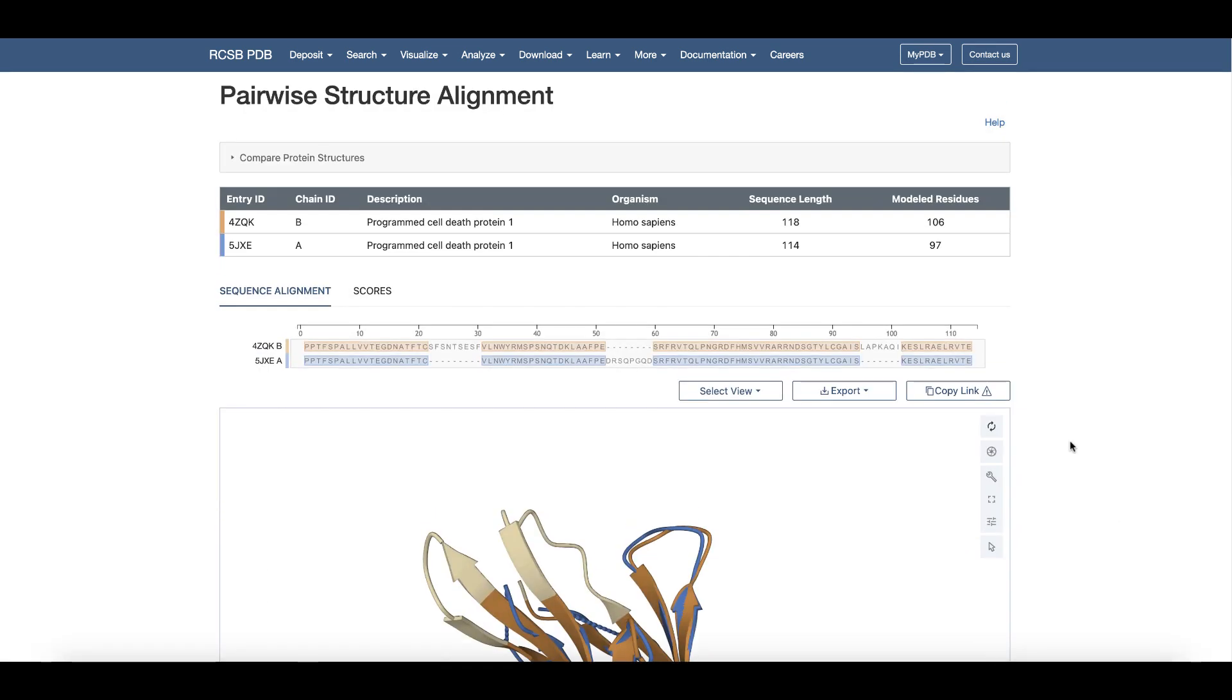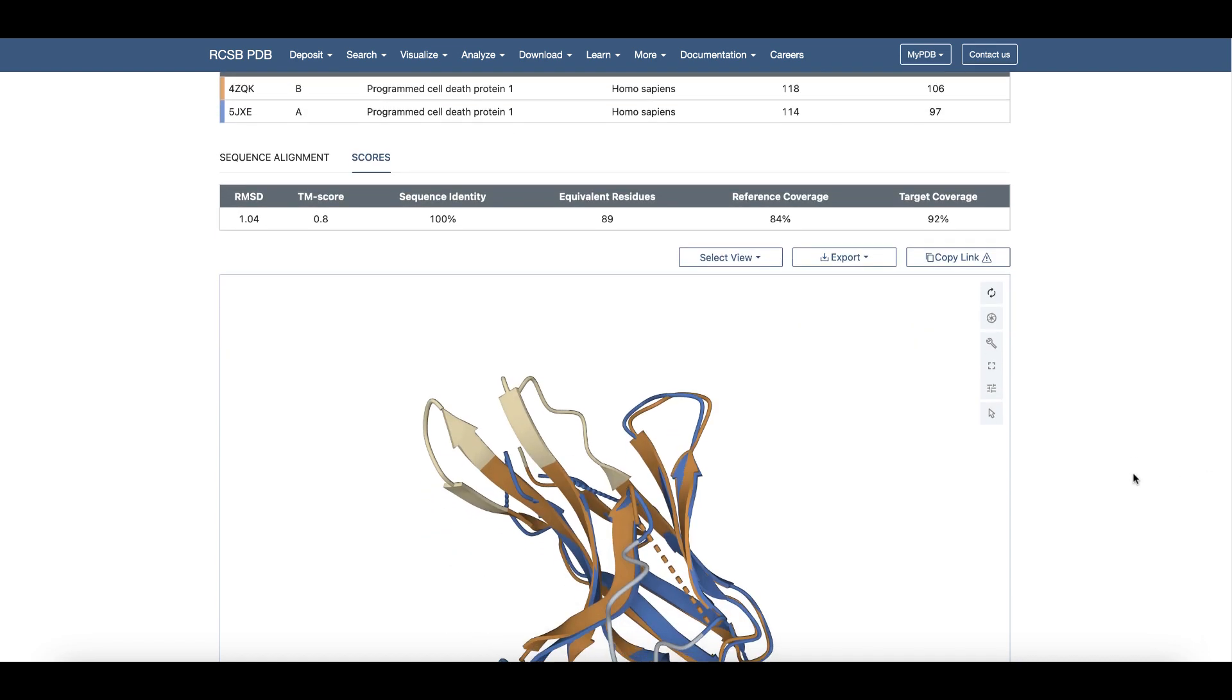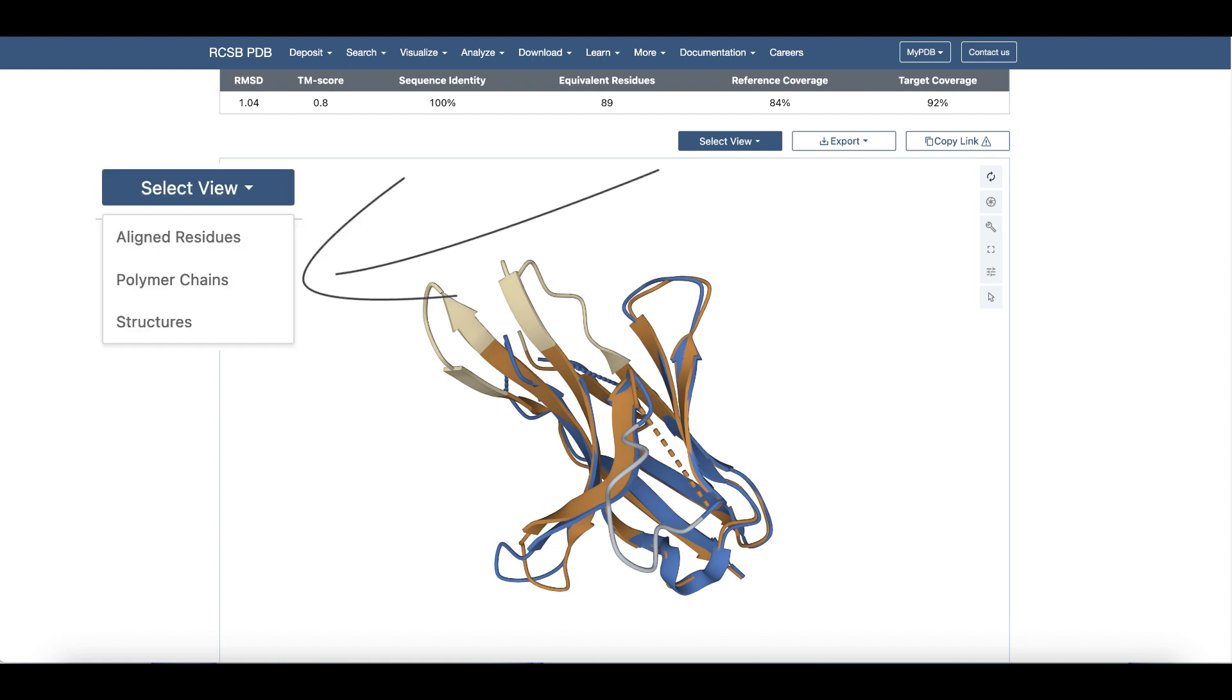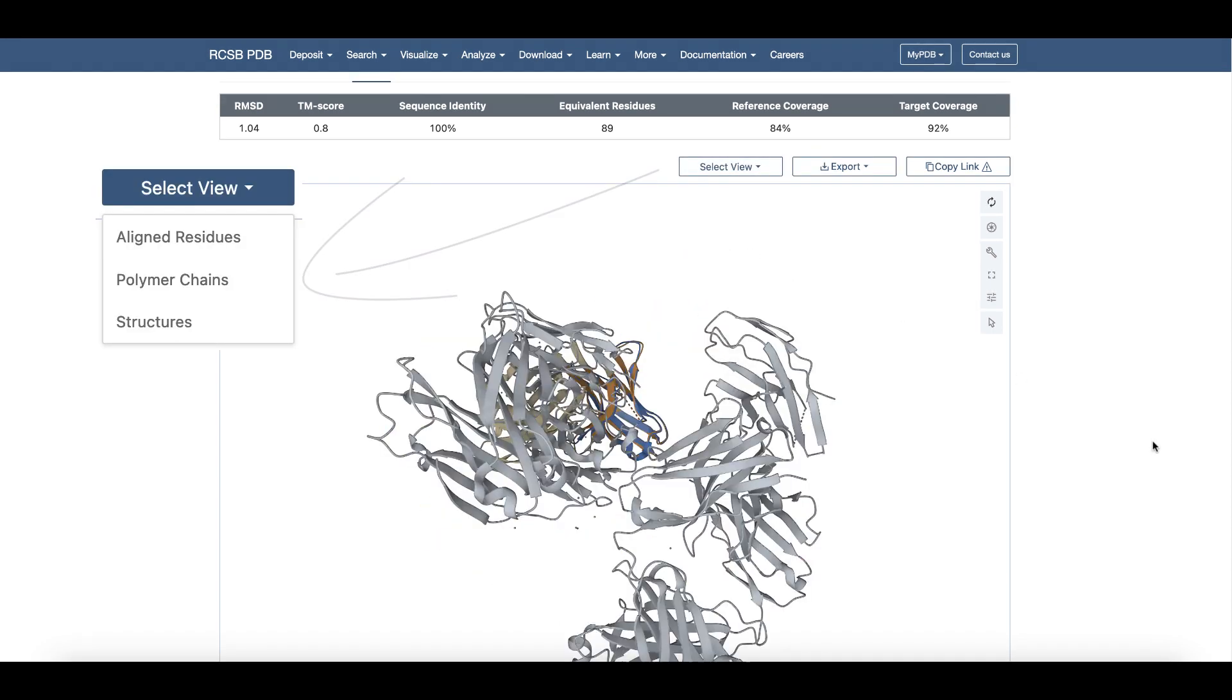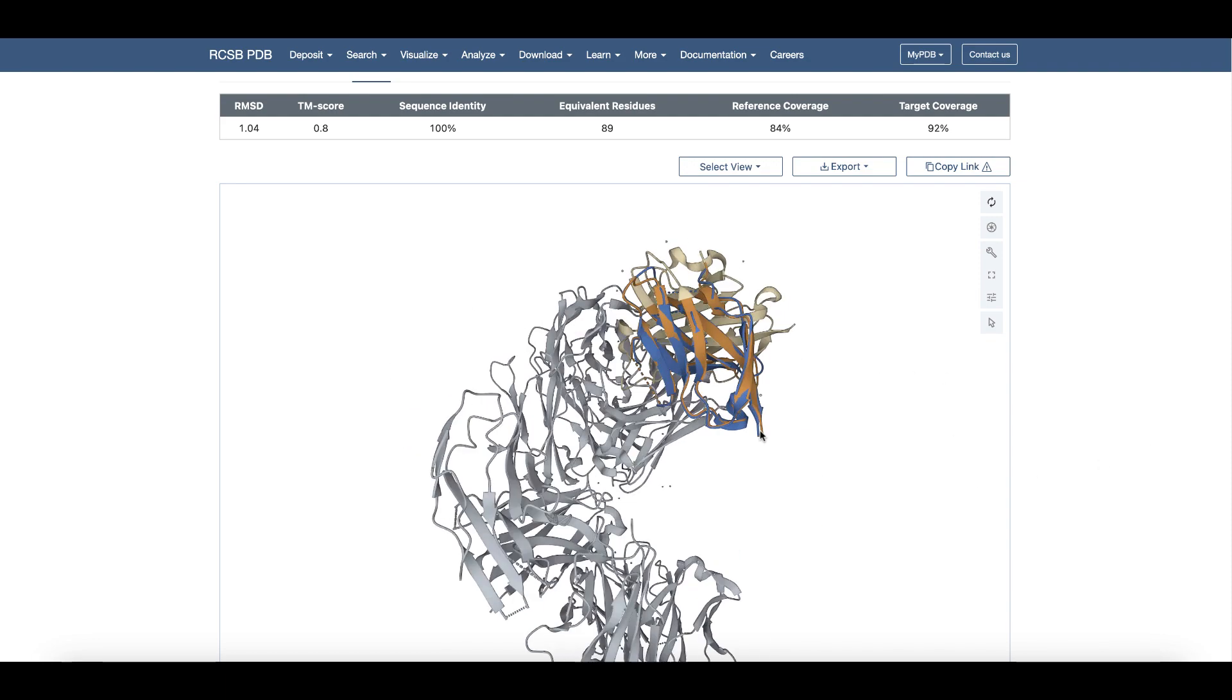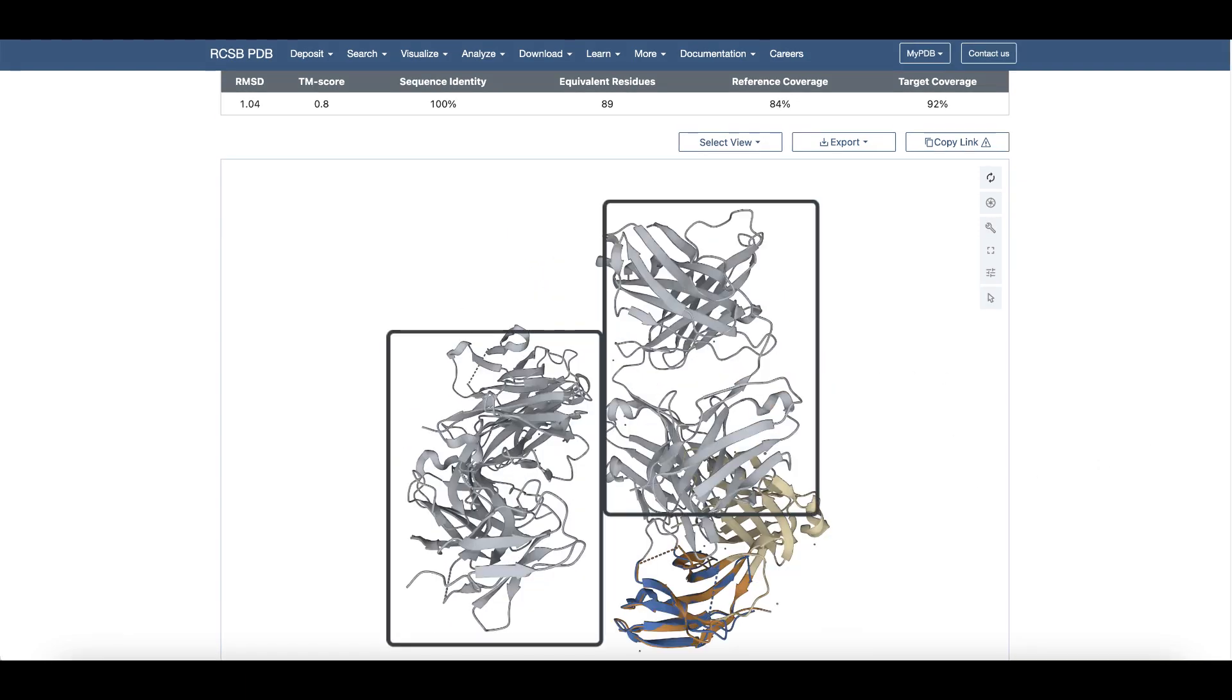The tool shows a good alignment of the PD-1 chains in these structures. The root mean square deviation of around 1 angstrom suggests that the PD-1 protein chains in these structures are nearly identical. Now after the alignment, choose the structures from the select view options. The matched parts of the chains are colored darker than the unmatched parts. The gray protein chains corresponding to the pembrolizumab bound structure occur in two groups.